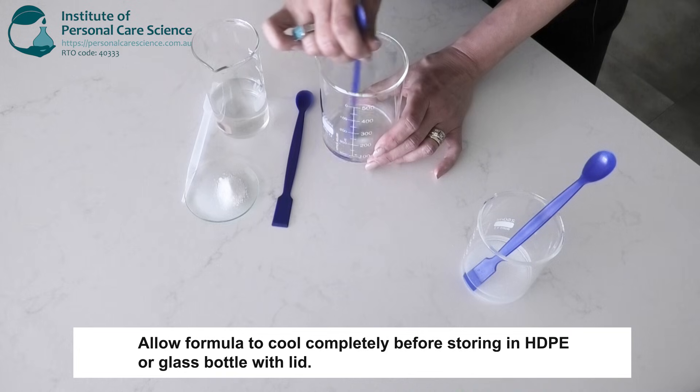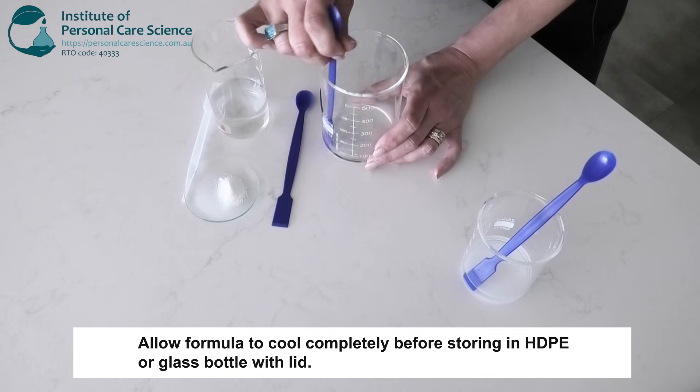Just remember with base solutions you need them to be completely cool before you pour them off into an HDPE or glass container.